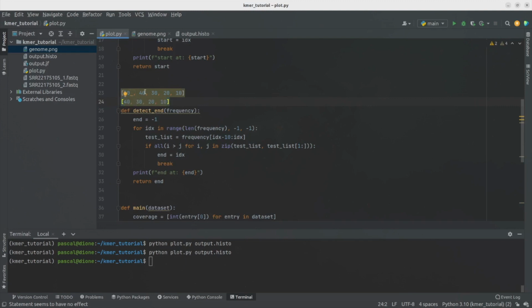Yes, it is. Again, yes, it is. Yes, it is. Yes, it is. And 10 over here is going to be ignored because the zip doesn't have a match for it. And then we say, okay, the list is actually, again, increasing. Everything is true. It's increasing from the right side to the left side. And this will be flagged as an end for us.